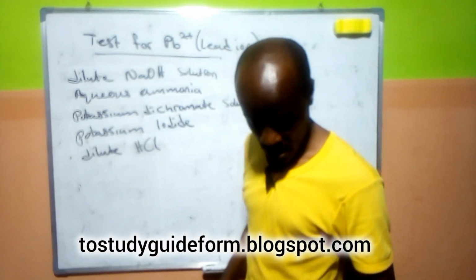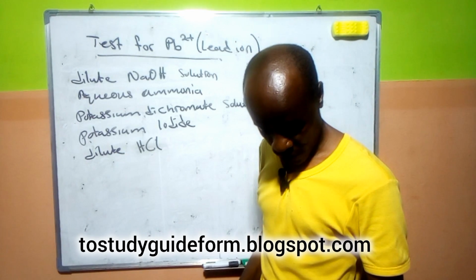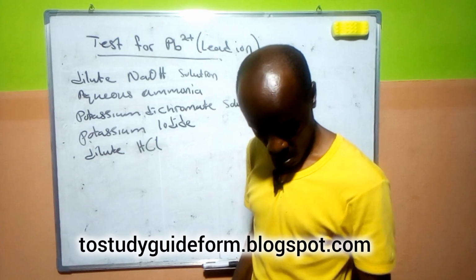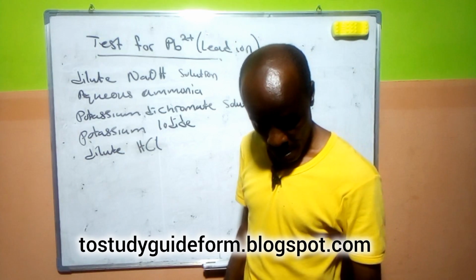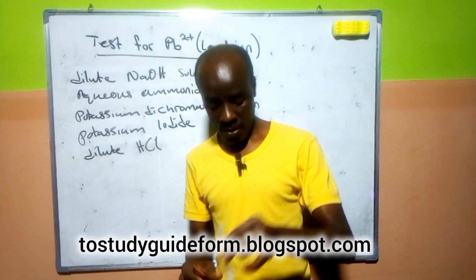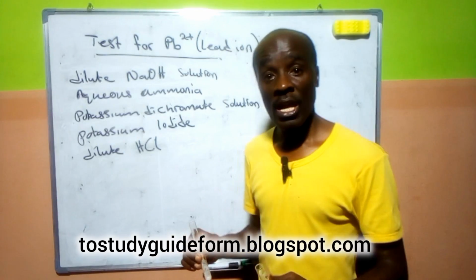So let's try in excess to know what we get if we add excess of sodium hydroxide solution. I want to encourage you to pay attention and watch this to the end, so that you'll be able to know what it's all about. You will never have problem again in identifying lead ion.